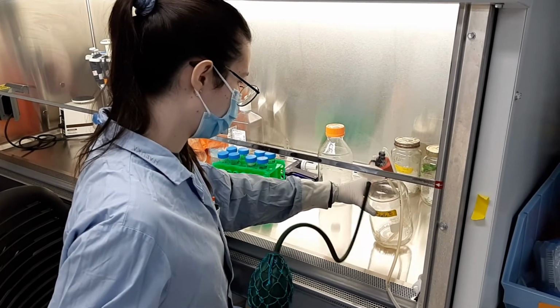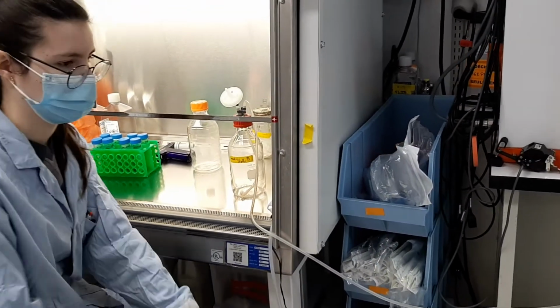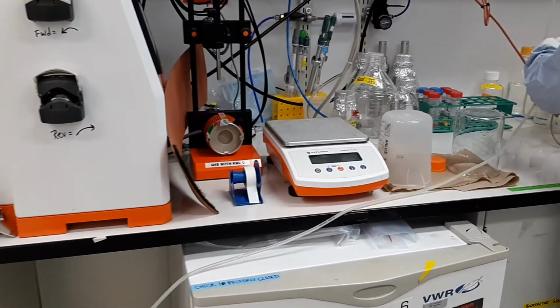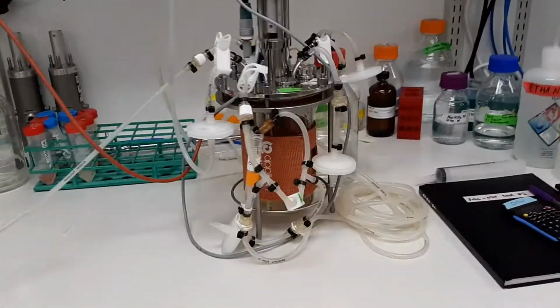I produce these viruses in bioreactors at the lab scale, so usually 1 or 3 liters, so that in the future they can be scaled up to industry-scale bioreactors. I also work on analytics, which is developing assays to quantify and characterize the viruses I produce.